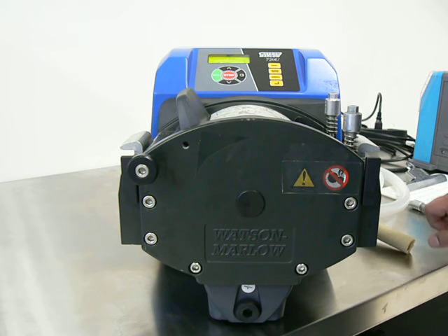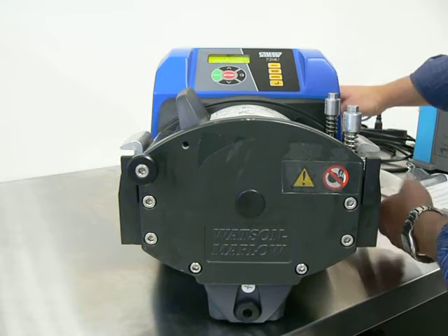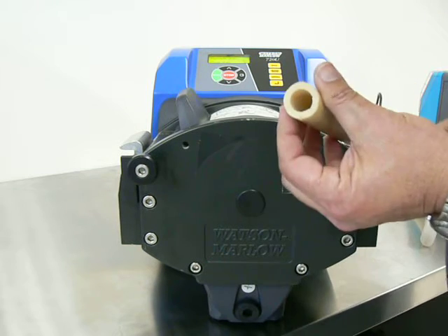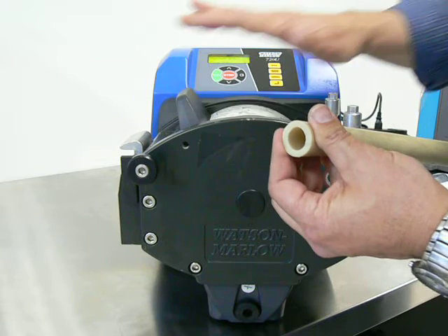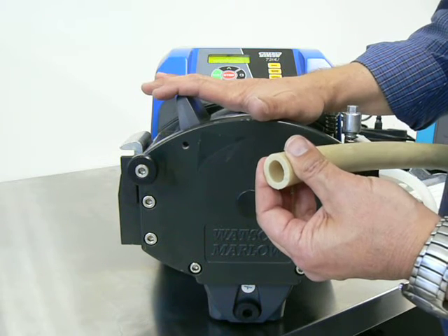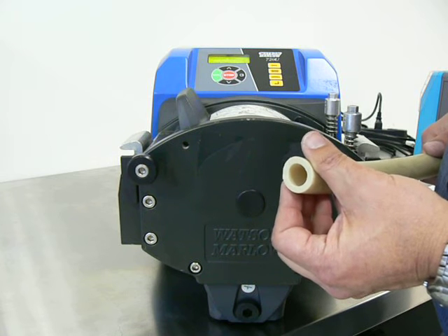Watson-Marlow pumps are designed primarily around tubing wall thickness. This is a little different. Each model is designed to work with a specific tubing wall thickness, independent of the inner diameter of the tubing. The pumps are designed to look for a particular wall thickness. This pump, the 720 and similar series, comes from the factory designed for 4.8mm wall thickness tubing.